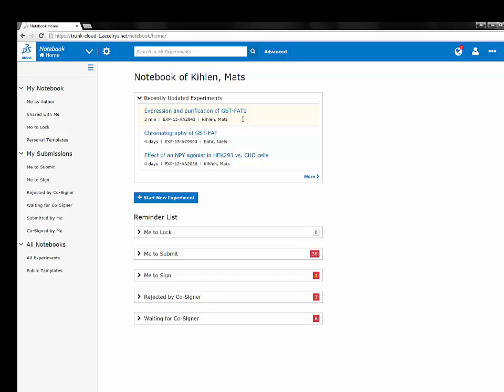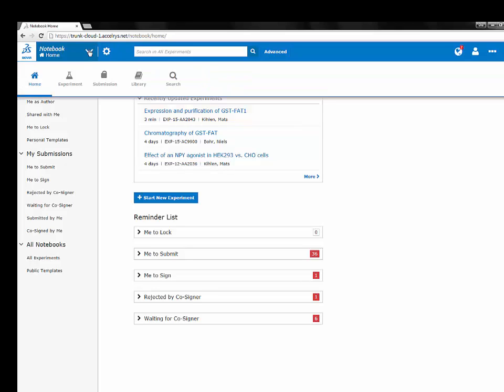Along the top of the screen you will notice the new navigation bar. This is always visible throughout the notebook. By clicking on the arrow you can browse between Home, Experiment, Submission, Library, and Search.